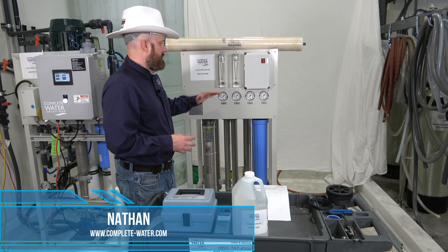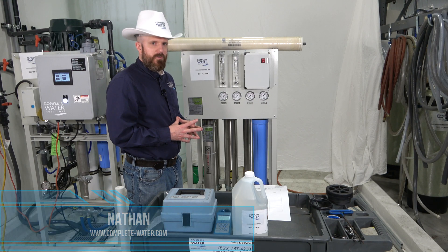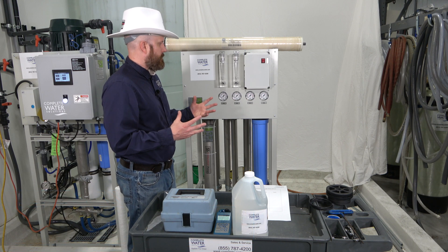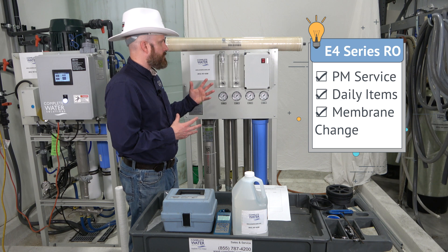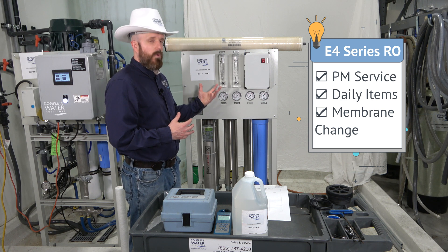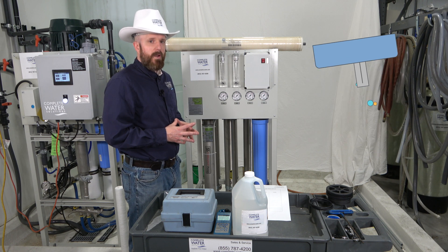Hi, Nathan with Complete Water Solutions. We're going to cover the E4 series RO system as well as the preventative maintenance items. We'll cover topics like what you should be testing daily, as well as RO membrane change out.